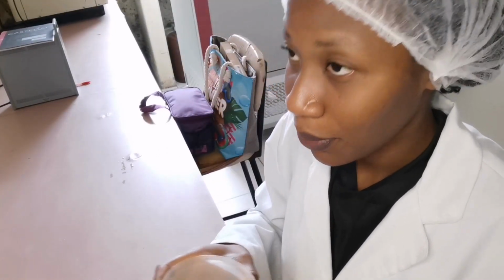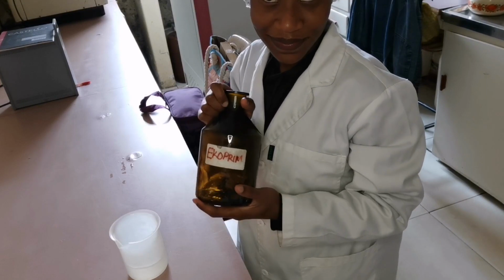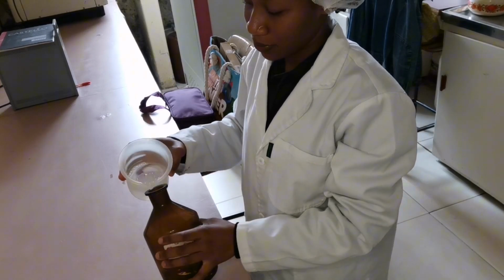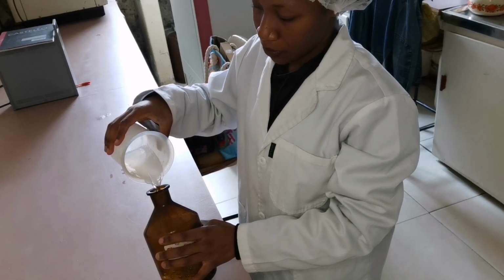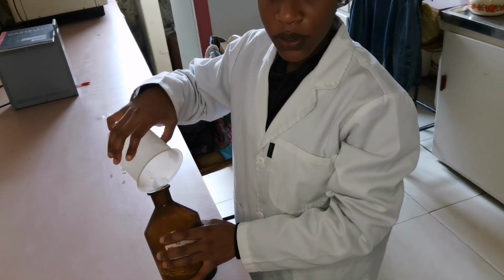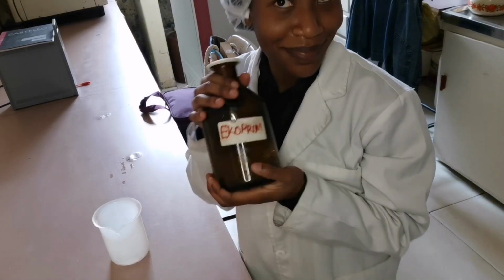So our Ekoprim has fully dissolved. Okay, now let's pour it into this Ekoprim jar. There is no need to sterilize the Ekoprim. So it's done. 3 hours later.